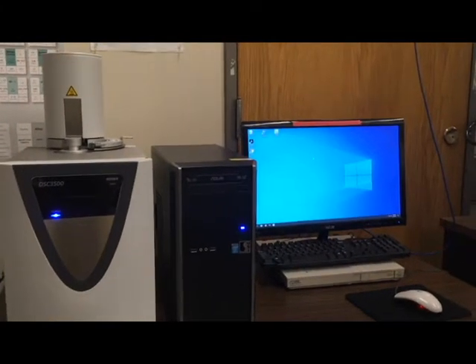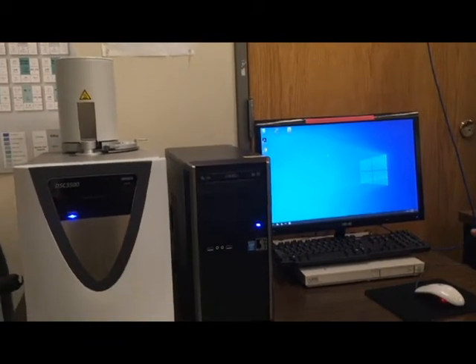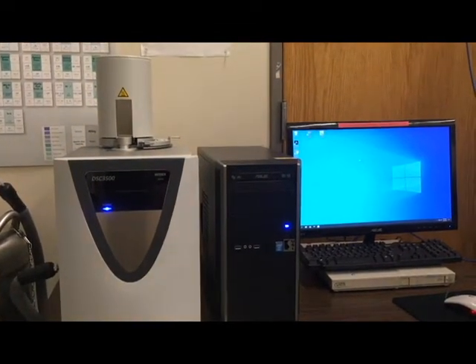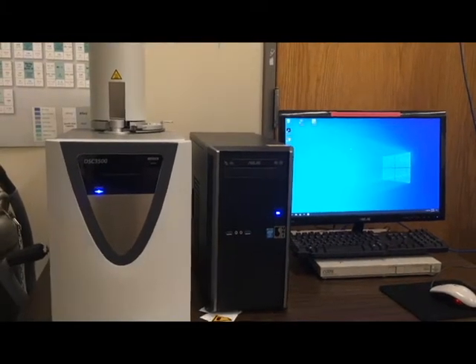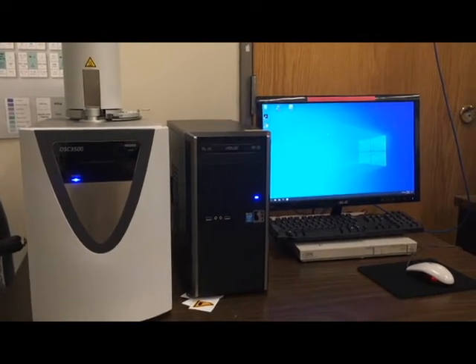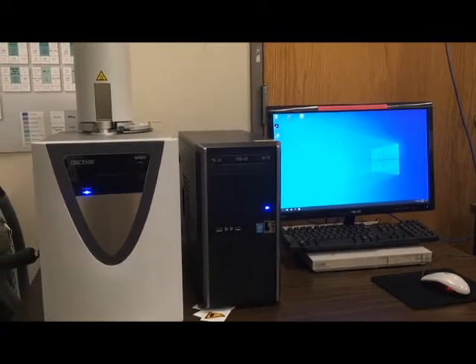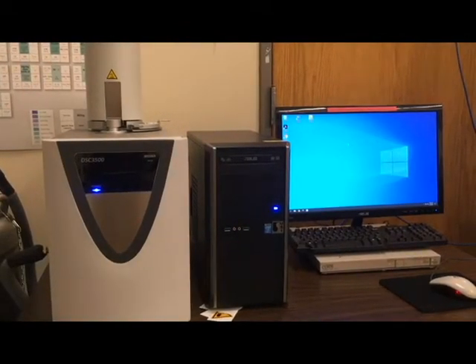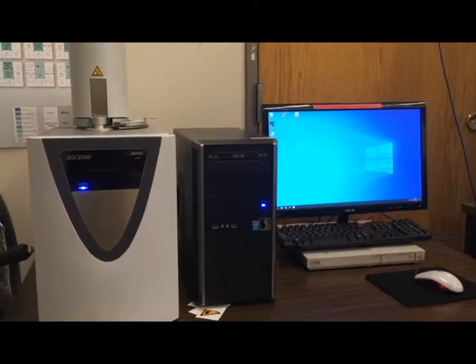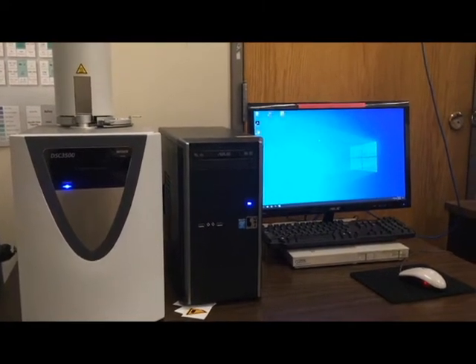At this point, the DSC needs to have been turned on for at least one hour before you start on the actual scan. You can tell it's turned on because it's got the little blue power button lit. Because it needs an hour to warm up, the earliest you can schedule it during the day is 10 o'clock. You're welcome to come in at 9 o'clock to start prepping samples, but I wouldn't recommend starting the machine until about 10. One hour before your scheduled time, it is recommended to come in or call the lab to make sure it gets turned on in anticipation of your arrival.